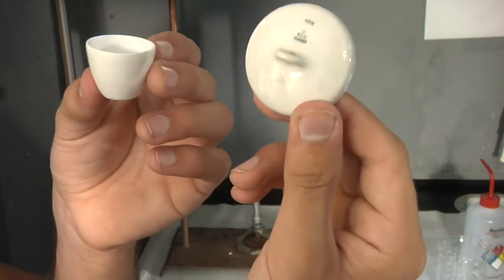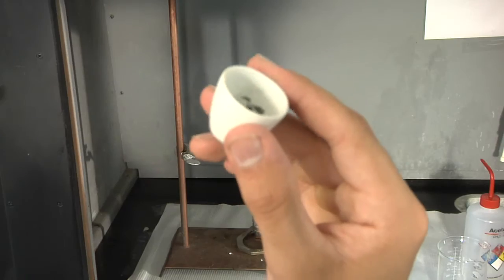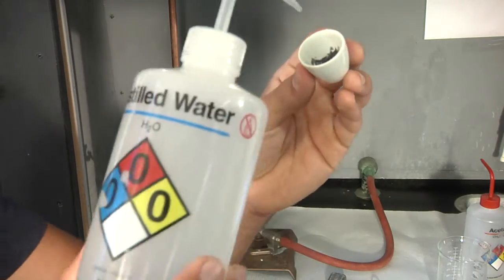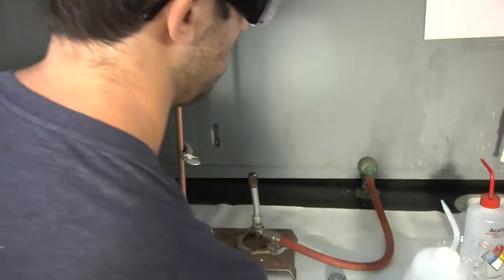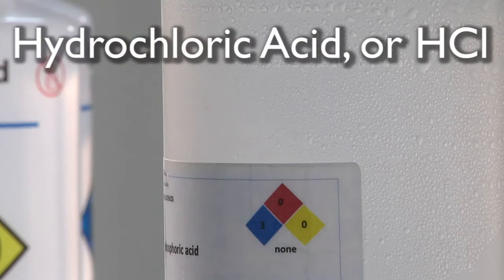Obtain a crucible and its cover, but be careful — these are expensive and fragile. If there is any loose dirt or other gunk in your crucible, wash it away with a little water and a paper towel. If that doesn't work, it's time to bring in the cavalry.